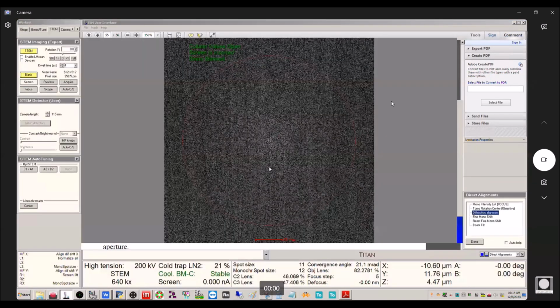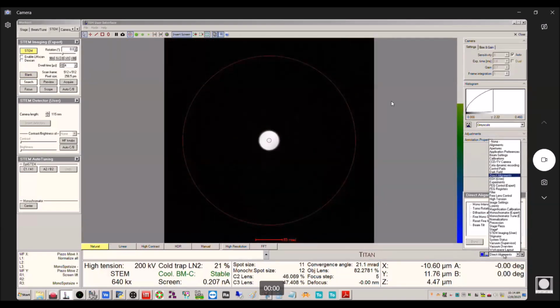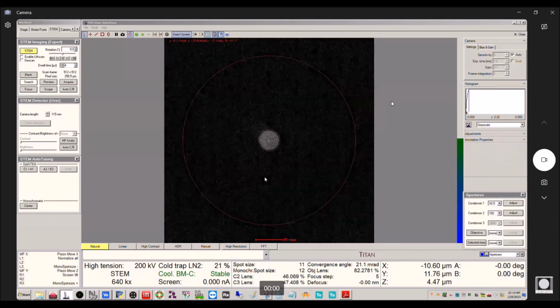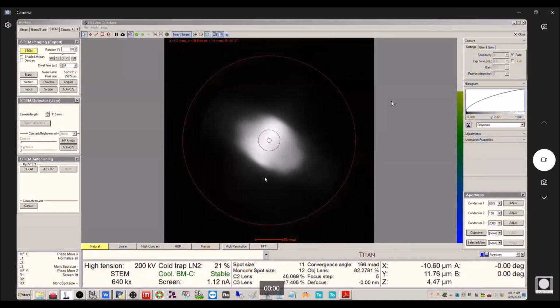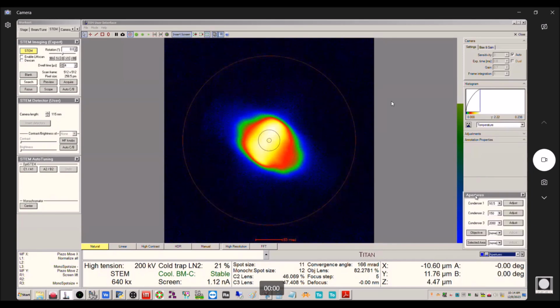All right, so I come back here. Now that I have that centered, let me take this guy out. See, it's a little easier to see the slit now. You can see basically the outline of the slit, if you will. And it's not in focus, which it shouldn't be, right? Because you're not looking at the right plane. So this one shouldn't matter here.